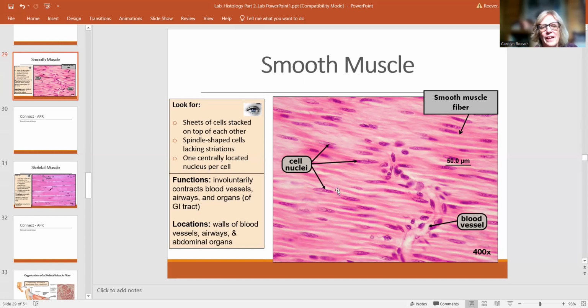So each of these is not round. It's not a round cell. It's a long fiber, cylindrical, kind of long and tubular and tapered at the ends. When I look at this, if they ask whether it has striations, I automatically think it does because of the long strand. Yes, strand. Okay, I gotcha.